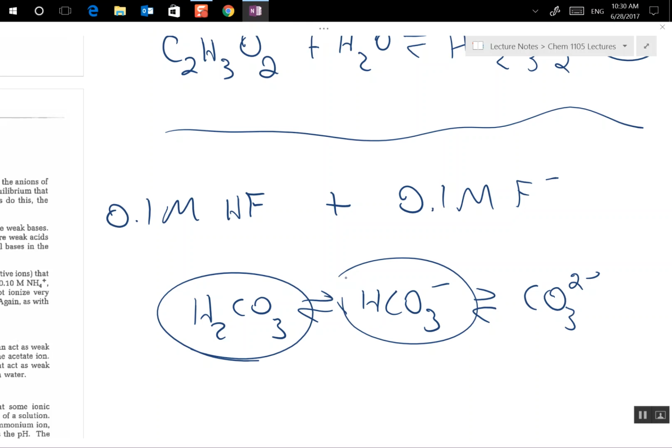With sodium hydroxide, you're going to do the same thing. Okay? Oh, that's the last part. I'm sorry. With water is the last part. The first part, you're going to take a buffer, acetic acid, sodium acetate buffer, and you're going to add the drops of HCl, and you're going to watch, and you're going to see that the pH doesn't change all that much. Yeah, it changes a little bit, but not really a lot.